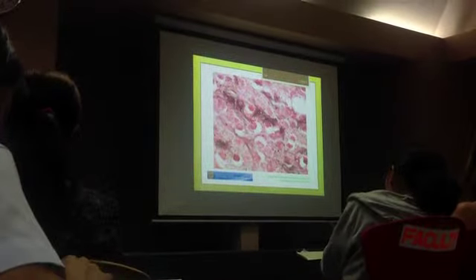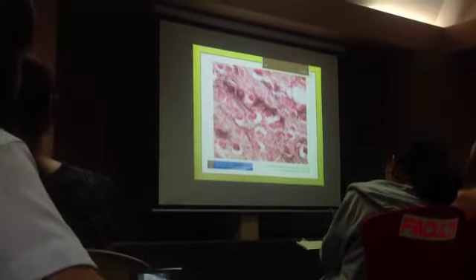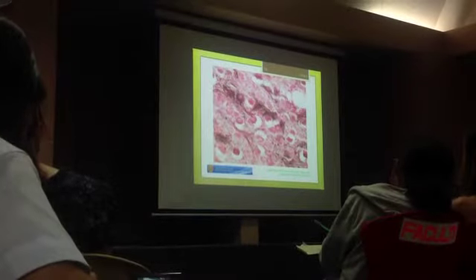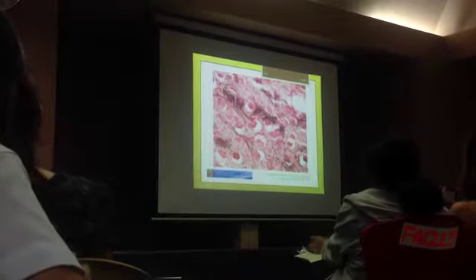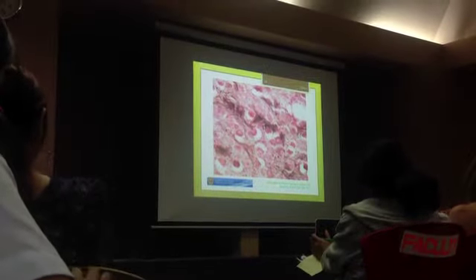So look here, the fibers are intimately related to the cells in your sympathetic ganglion. These are the neurons and these are the fibers.